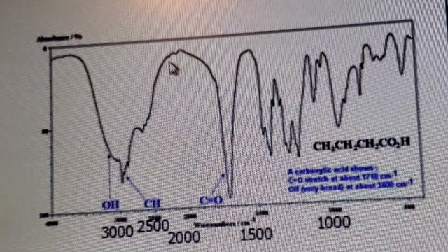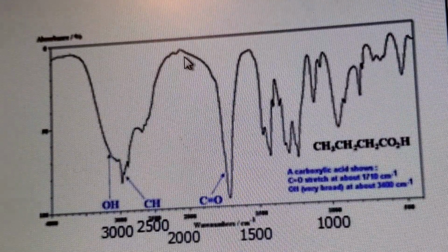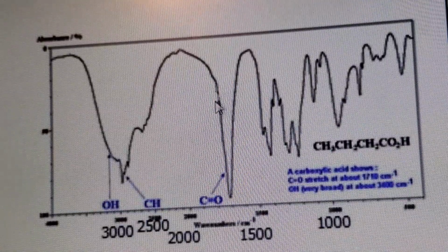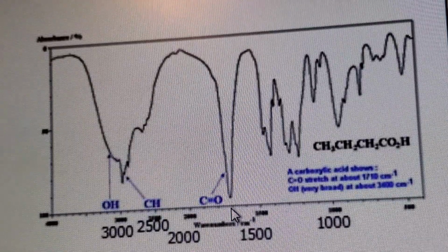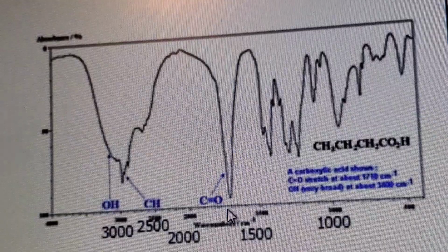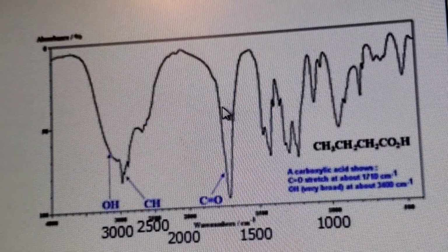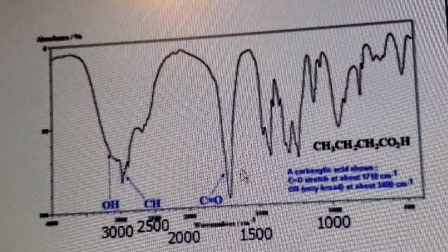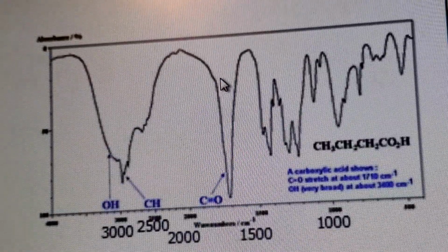And then you go around the 22 area, there's almost nothing. And this peak is very intense and somewhat broad, so we assume that's a carbonyl group. You see the numbers, even 1700 and a little more, and the intensity and the shape tell us that this is a CO double bond. So remember this feature for the CO double bond.